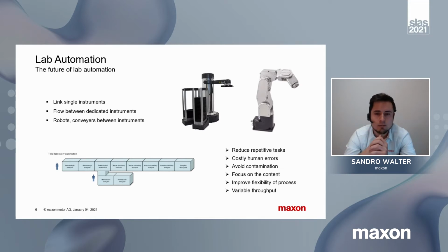However, it has also been shown that because of the cost pressure in this market, there is a trend towards central laboratories, which process the individual steps fully automatically with a high throughput. Total labs offer the advantage that if the design is successfully implemented, the costs are lower in the end, in the long term, also because often less staff is required. In addition to that, there are many other advantages, such as efficiency, standardization, and improvement in testing quality.